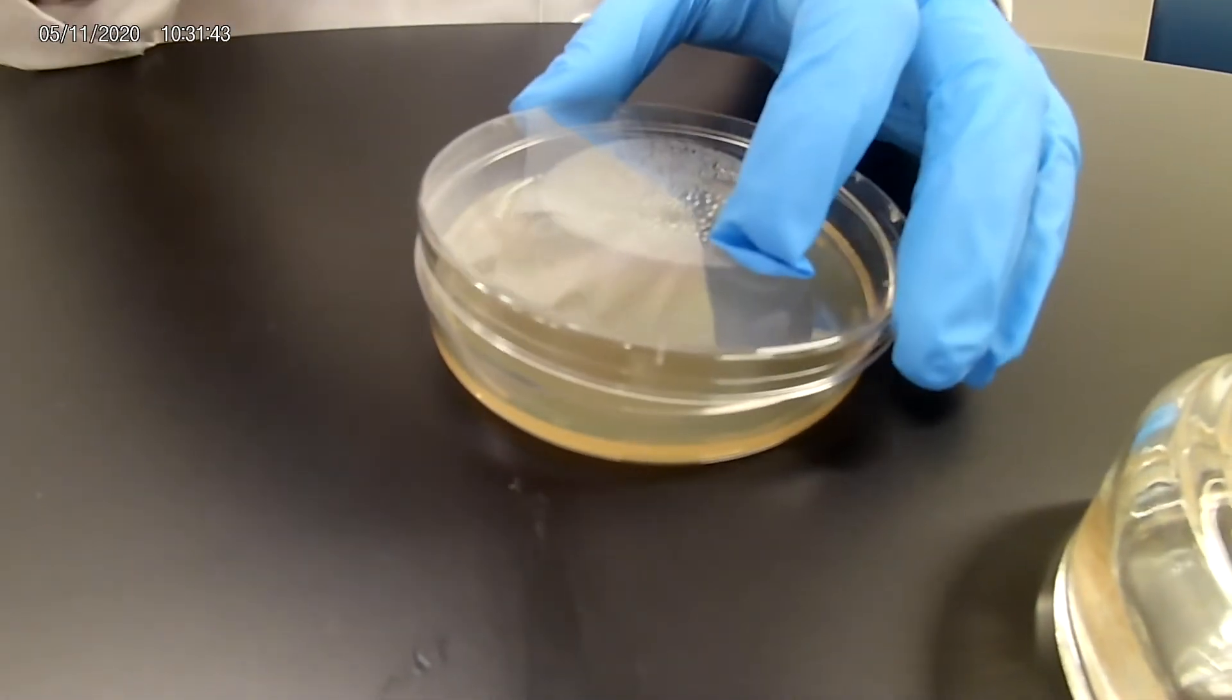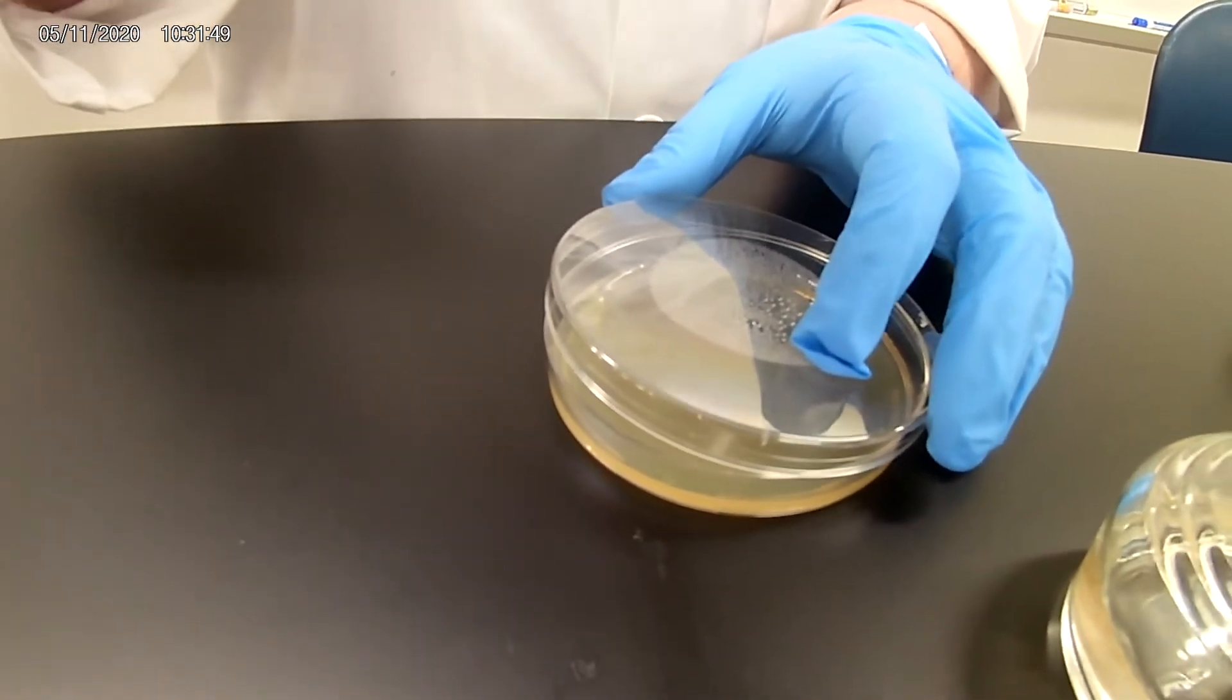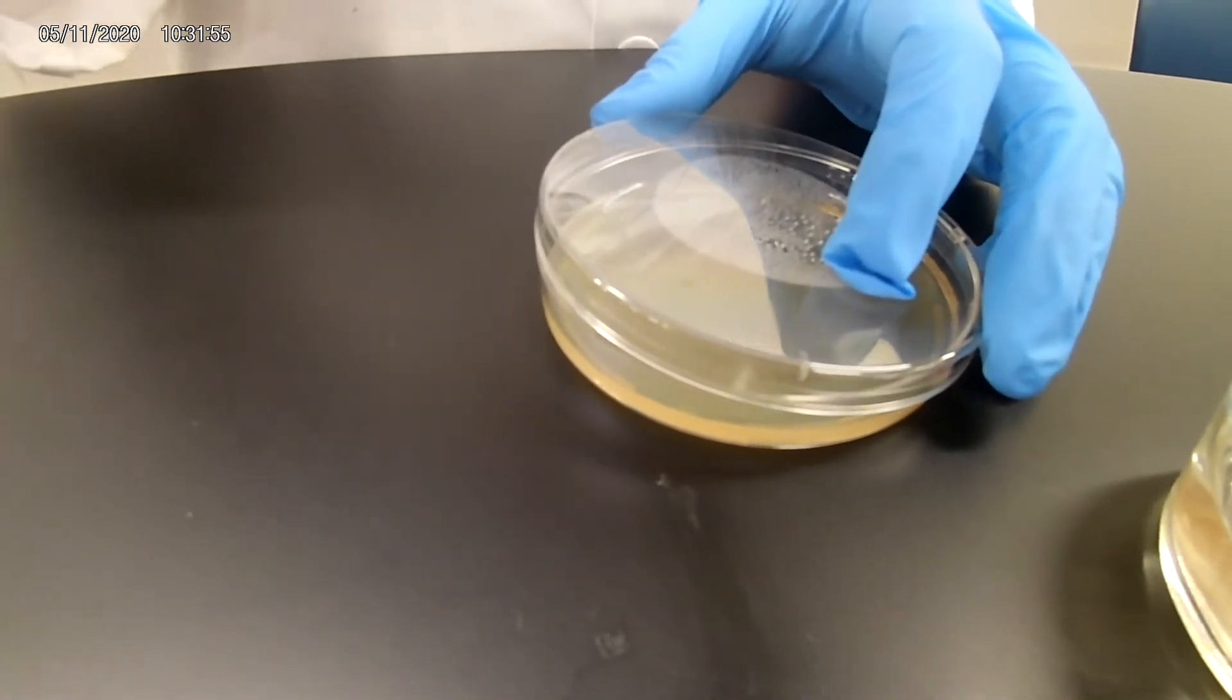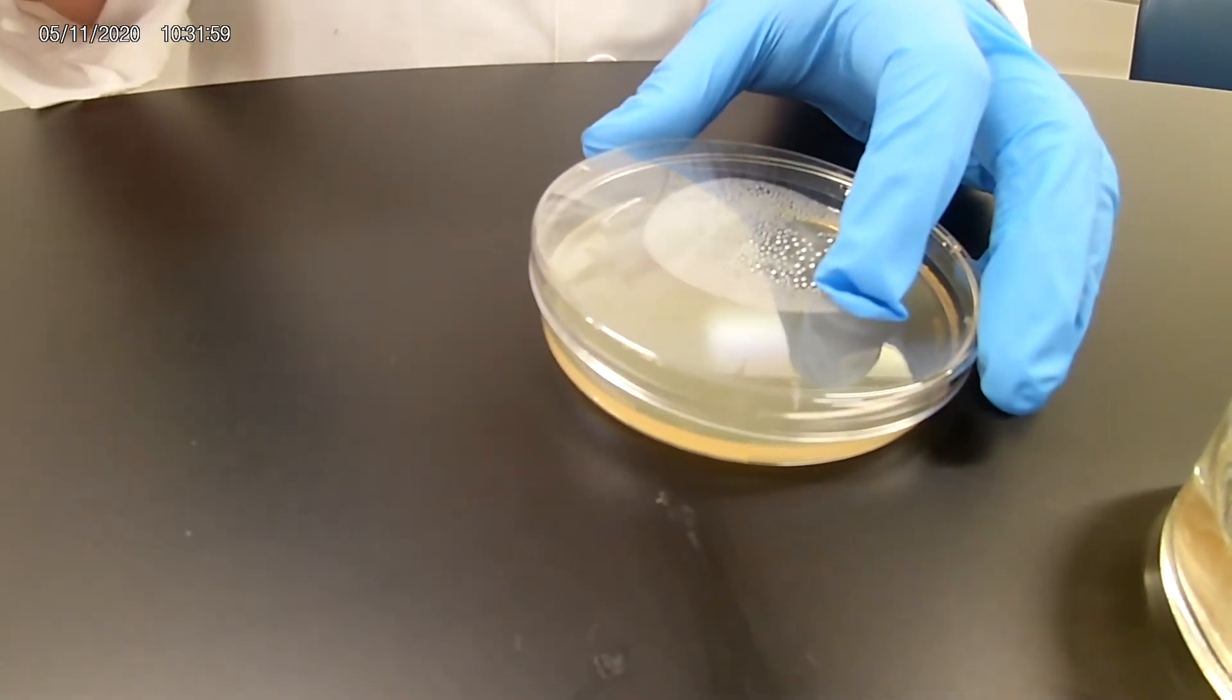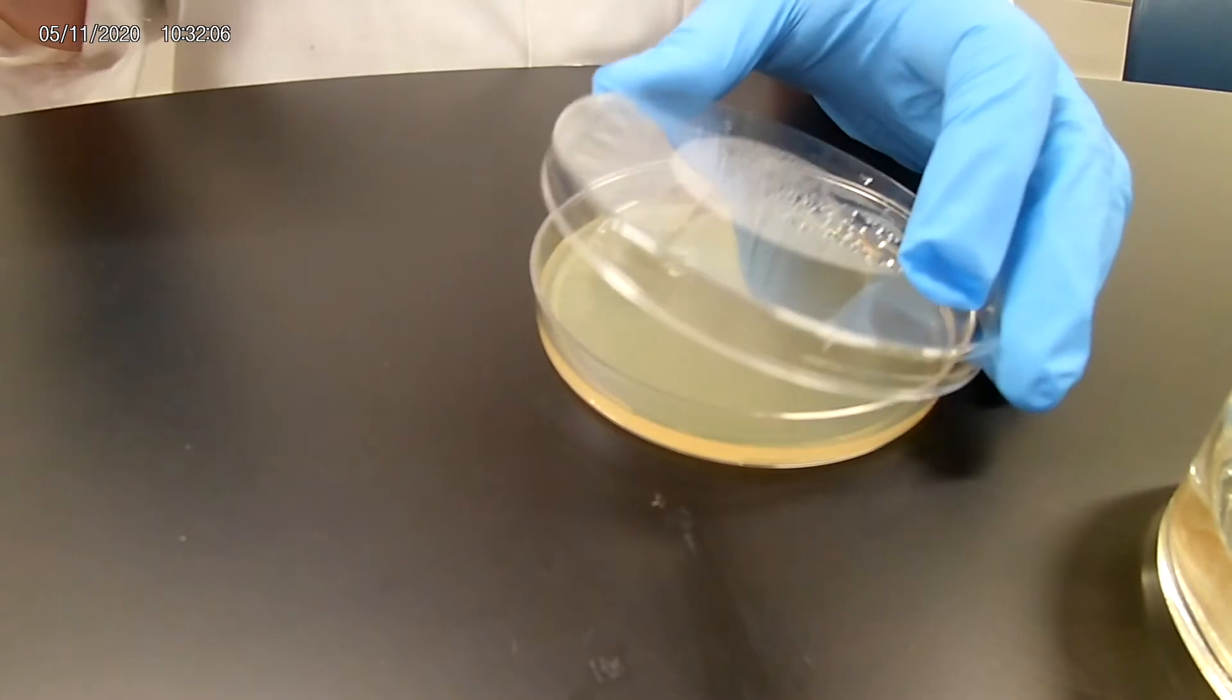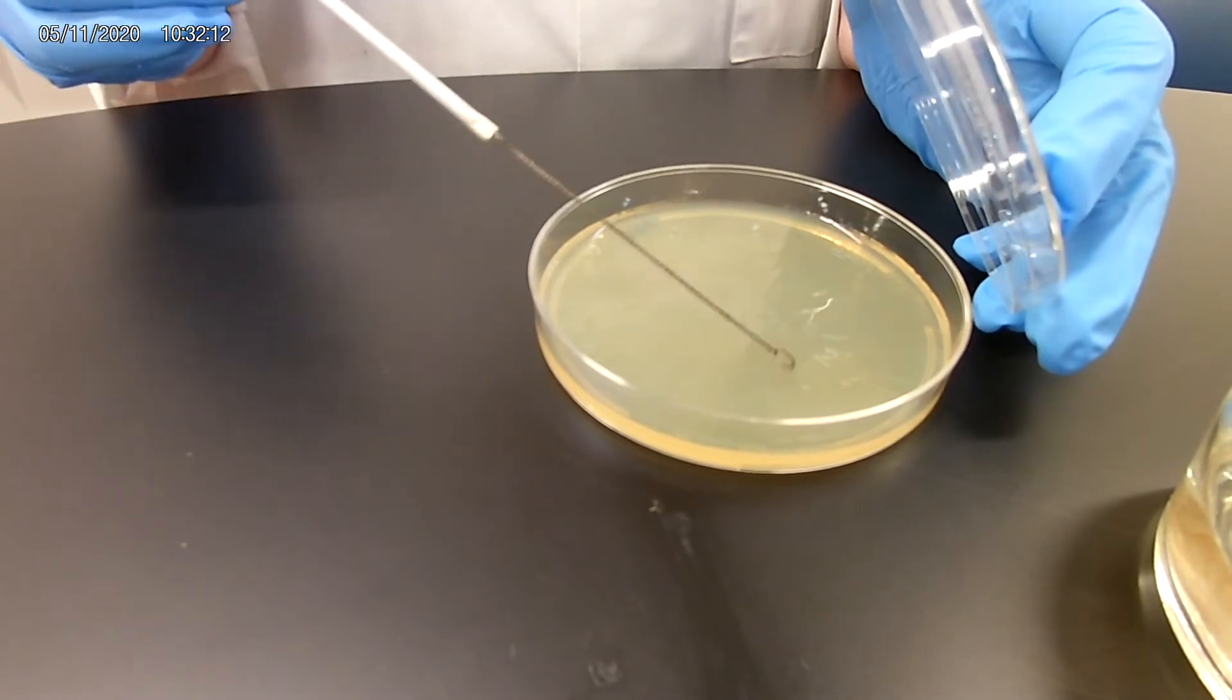Now you're going to flame the loop again to sterilize it. The idea behind this way is that we're going to spread it out in four different quadrants, but each quadrant is diluted from the previous one. So we're not going back into the original plate. We're going to go where we previously streaked over here, and now we're going to streak this way.